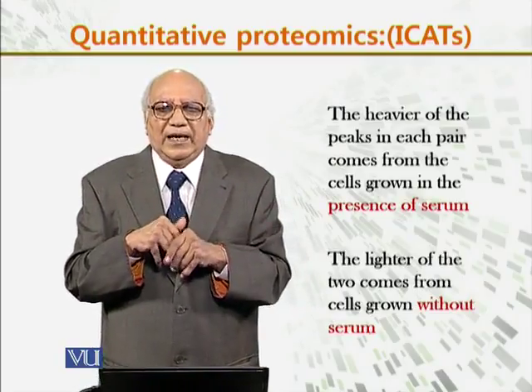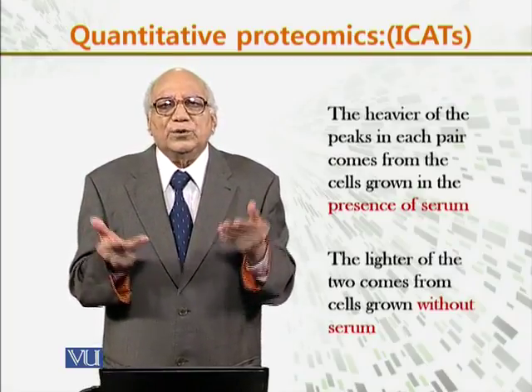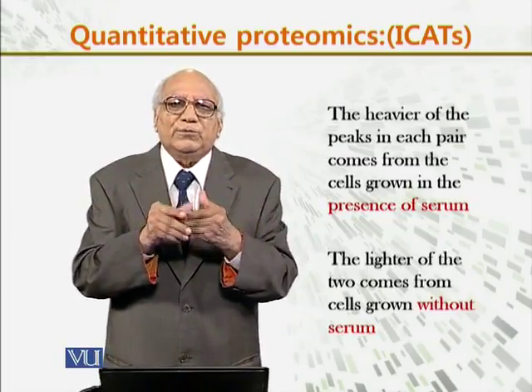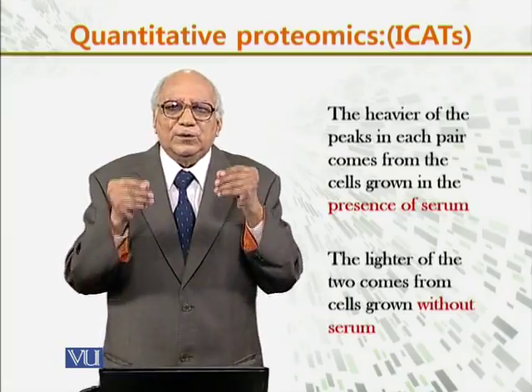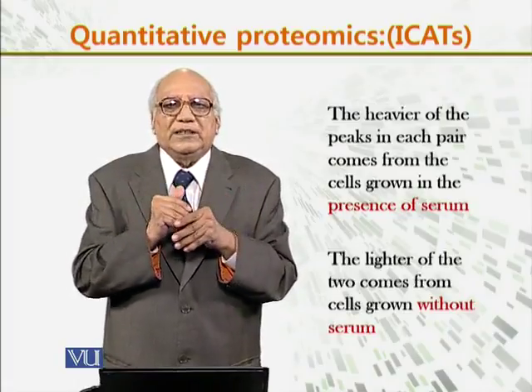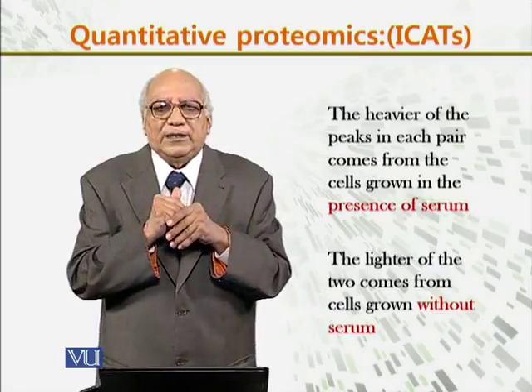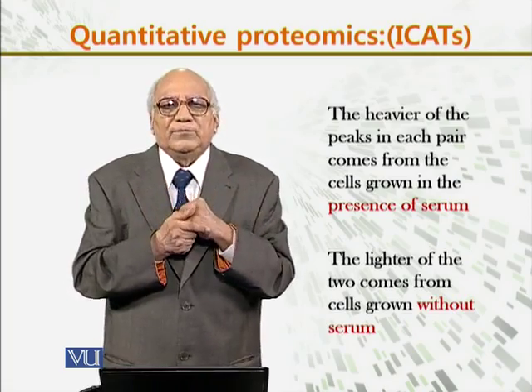The lighter of the two comes from the cells grown without serum. So the cells grown without serum give the lighter, lower peaks, and this helps us to differentiate between the two proteins or between the two components, and helps scientists to distinguish the weight and determine the mass, to quantify the different proteins.